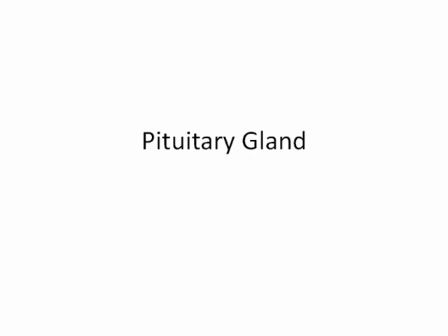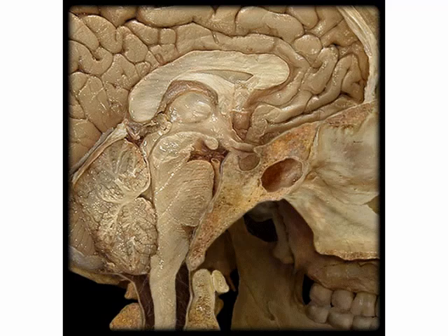In this recording, we will be looking at the endocrine glands that are in exercise 36 of your lab manual. So you'll want to have that with you so you can see some references there for the different cells and tissues we'll be looking at in each organ.